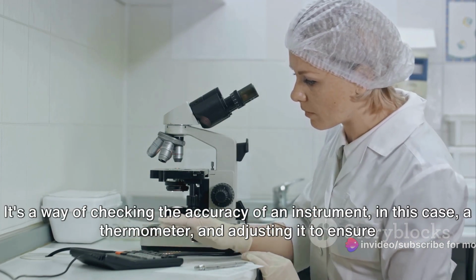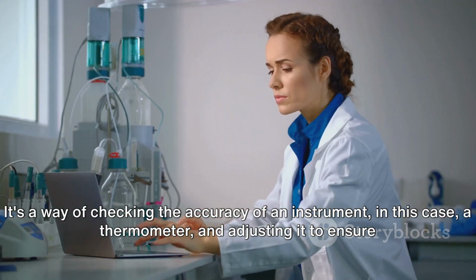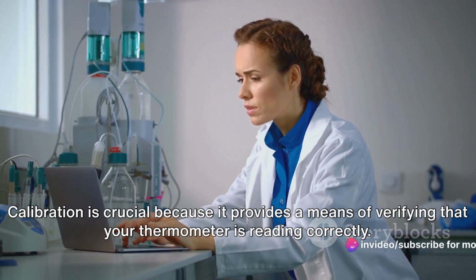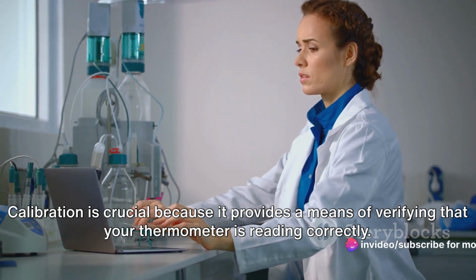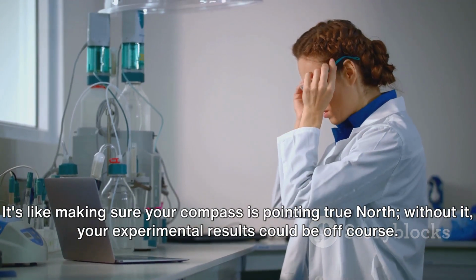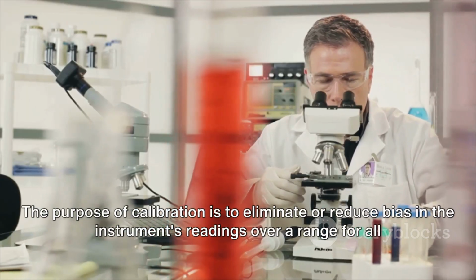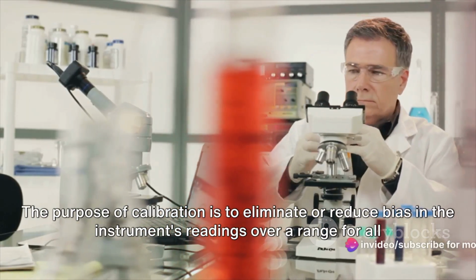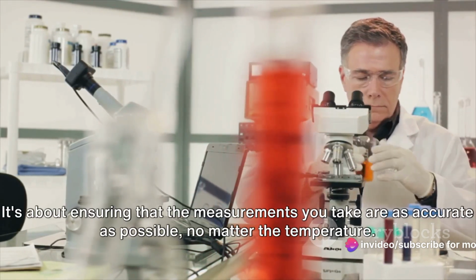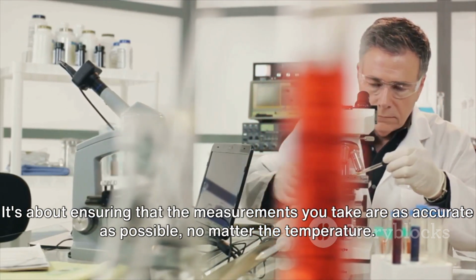It's a way of checking the accuracy of an instrument, in this case, a thermometer, and adjusting it to ensure precise measurements. Calibration is crucial because it provides a means of verifying that your thermometer is reading correctly. It's like making sure your compass is pointing true north. Without it, your experimental results could be off course. The purpose of calibration is to eliminate or reduce bias in the instrument's readings over a range for all continuous values. It's about ensuring that the measurements you take are as accurate as possible, no matter the temperature.